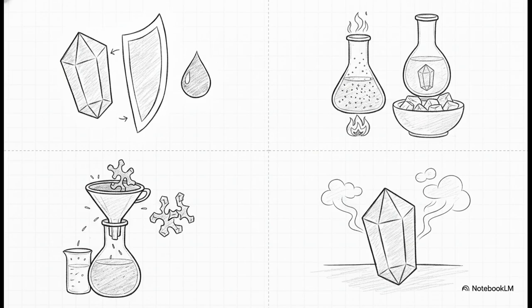But honestly, none of this beautiful crystallization happens without the perfect solvent. And the criteria an ideal solvent needs to meet are actually incredibly strict. First off, it absolutely cannot react with the compound you're trying to purify. It needs to dissolve a huge amount of the compound when boiling hot, but practically nothing at room temperature. For the impurities, it's the exact opposite.